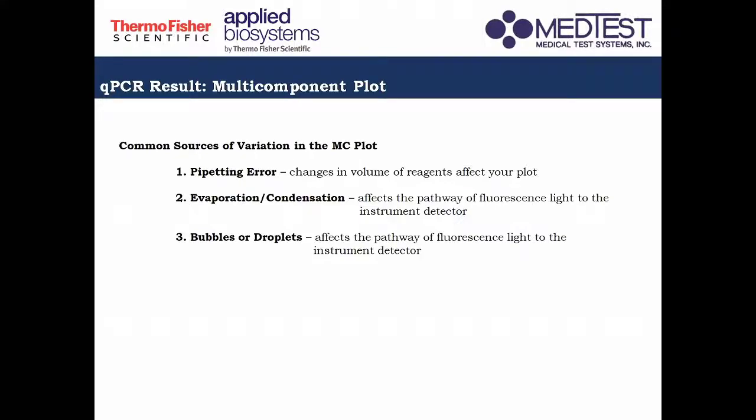Aside from the pipetting errors, we also can see in the MC plot that there has been an evaporation that took place in the PCR process. No? And this is important kasi in your, say for example, in your plate wherein you put your samples and then you put it in the instrument, no? Ang qPCR kasi is a PCR technique as well.